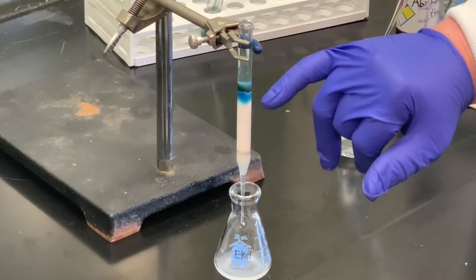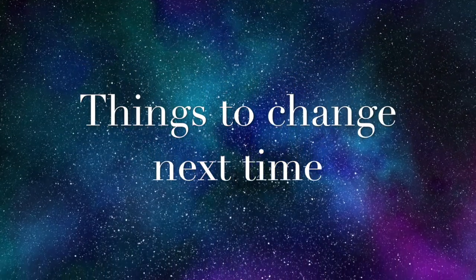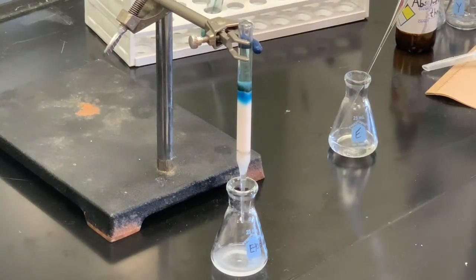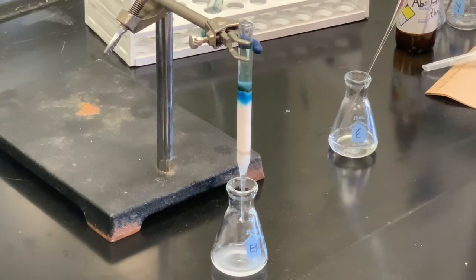There's no question here — we're seeing the blue band moving down. I should probably mention I should have used more sand between the cotton and the silica alumina. When doing column chromatography, even if that was completely colorless, we typically like to filter the collected material because there are always traces of silica or alumina — whichever packing material you're using — that can come through even though visually you don't see it. So most of the time when I've done column chromatography, I would filter it before doing anything else.